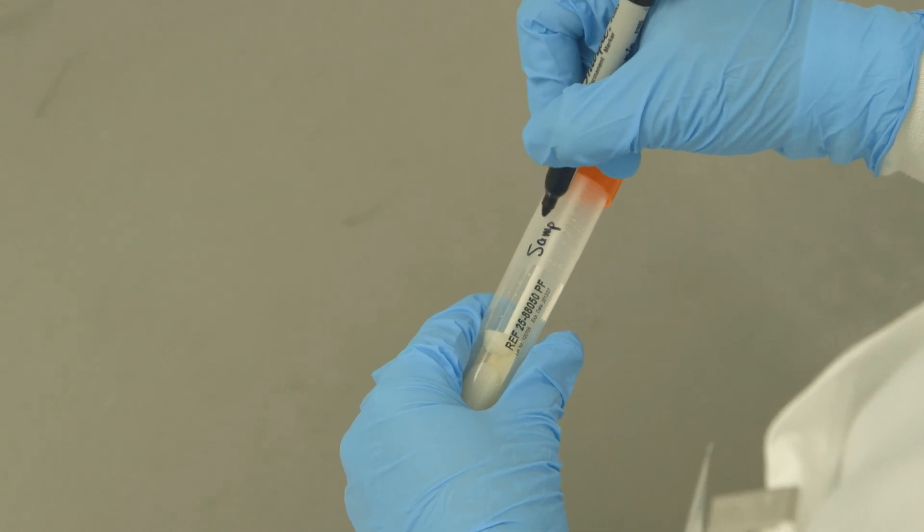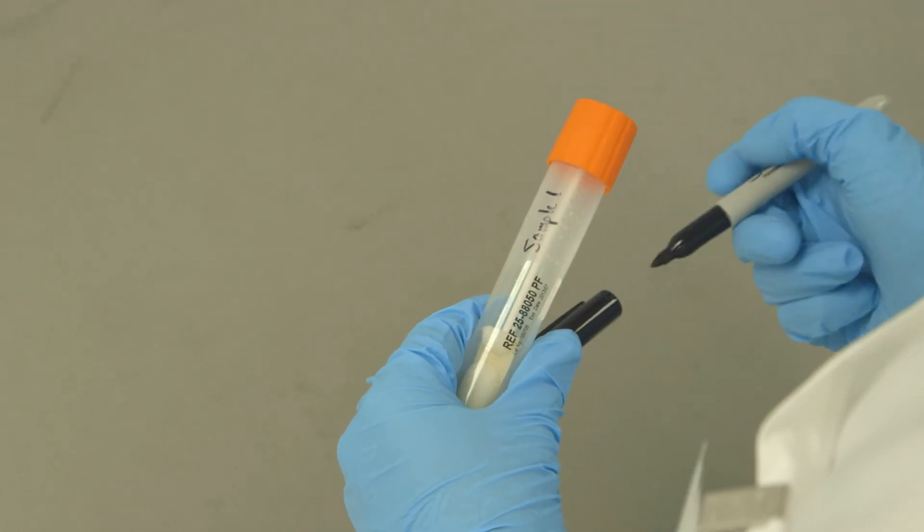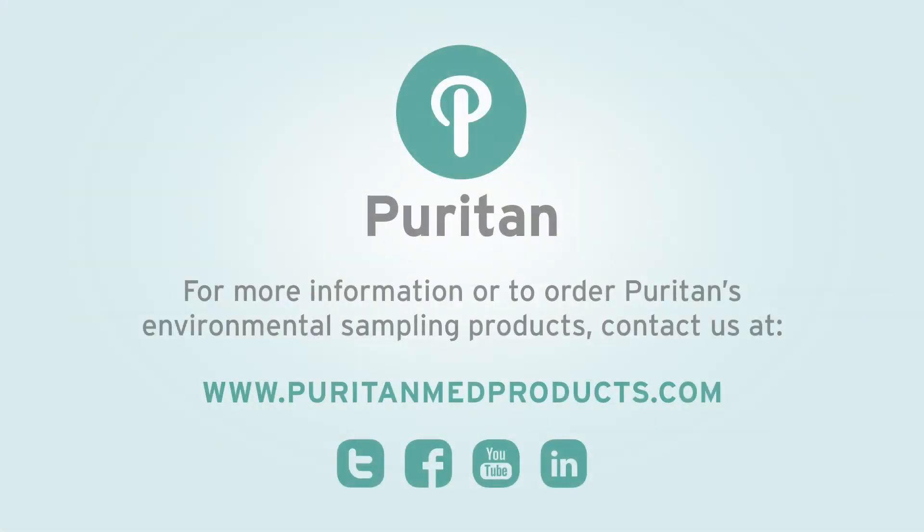If immediate testing cannot be performed, place samples in a refrigerated area.